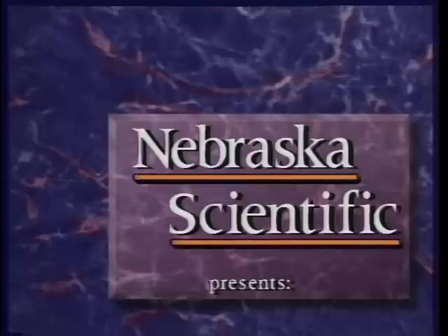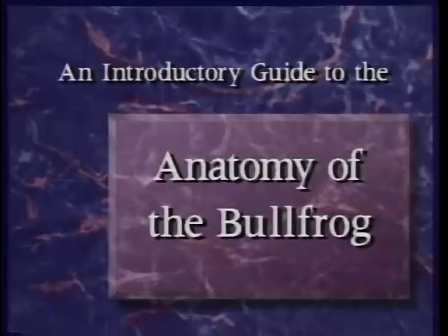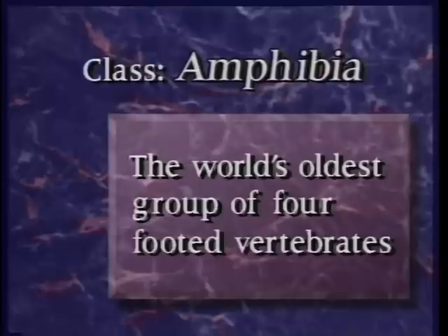Nebraska Scientific, a division of Seargas Company Incorporated, presents an introductory guide to the anatomy of the bullfrog. Bullfrogs are a member of the class Amphibia, the world's oldest group of four-footed vertebrates.